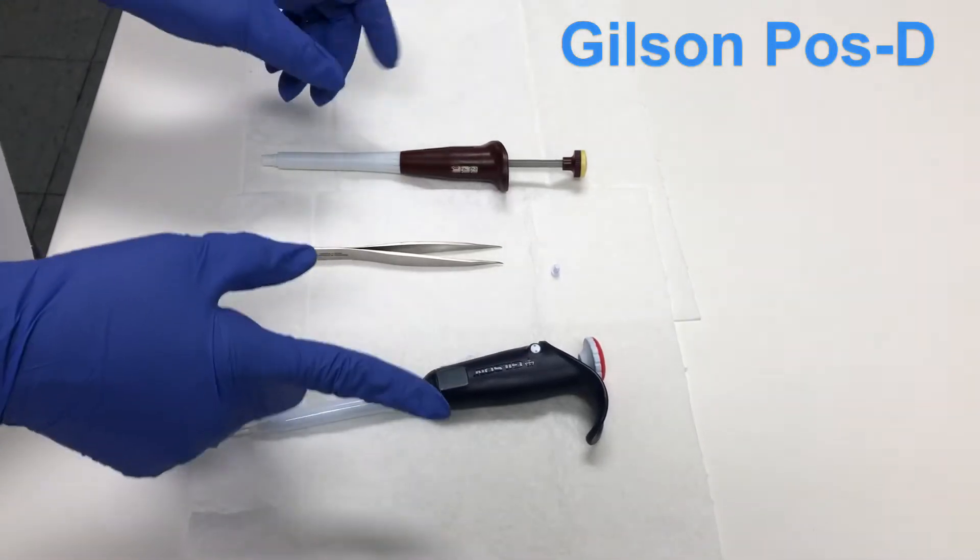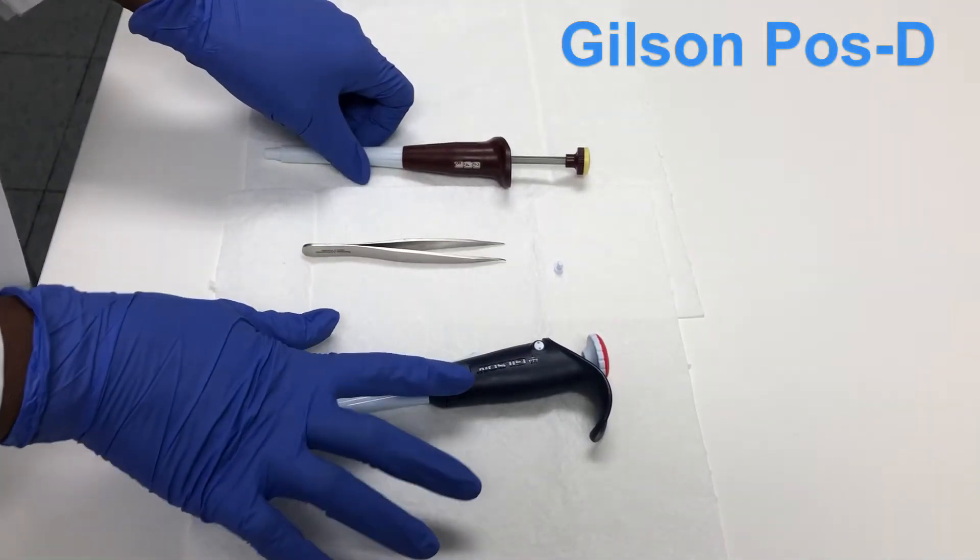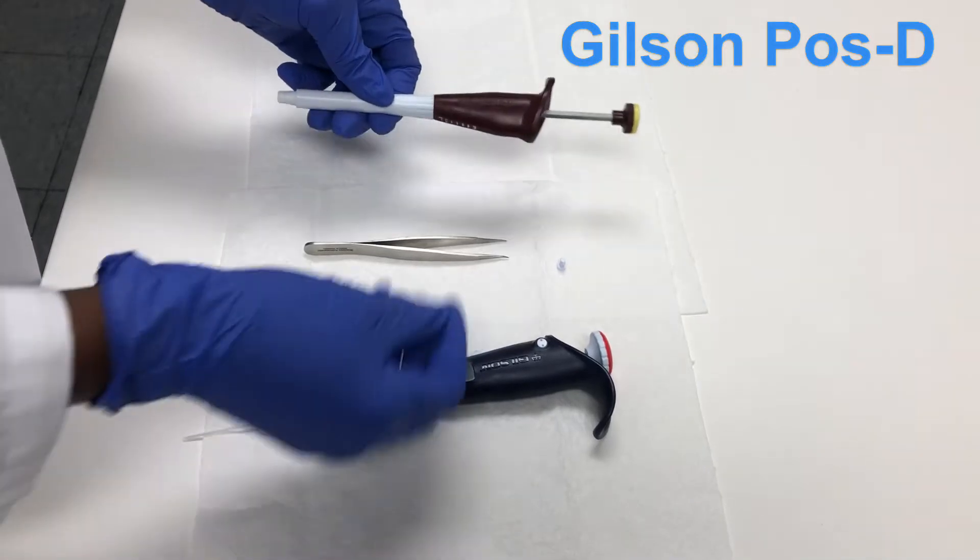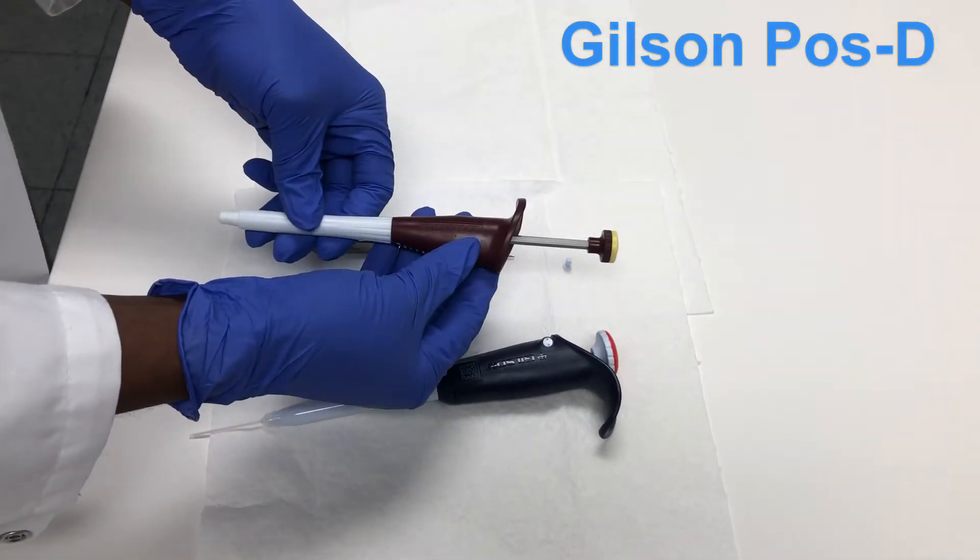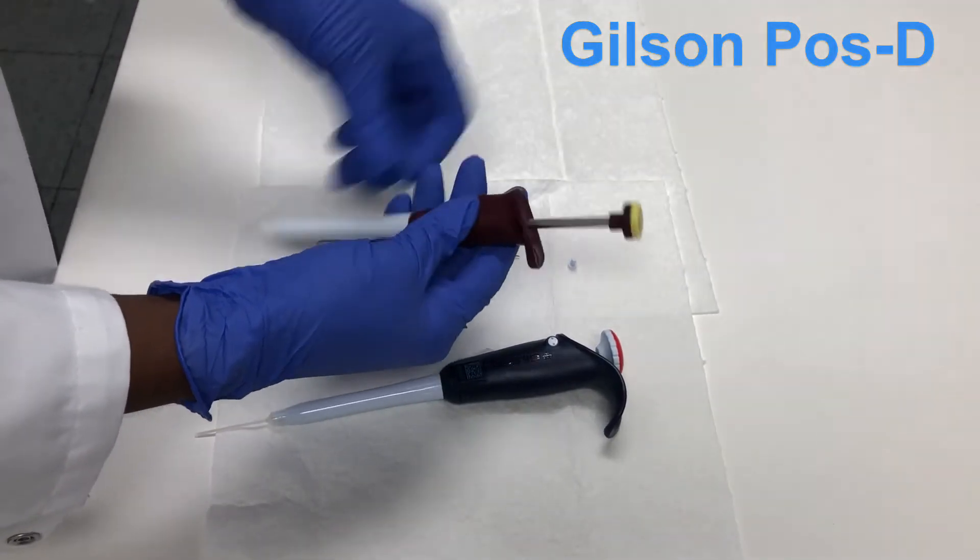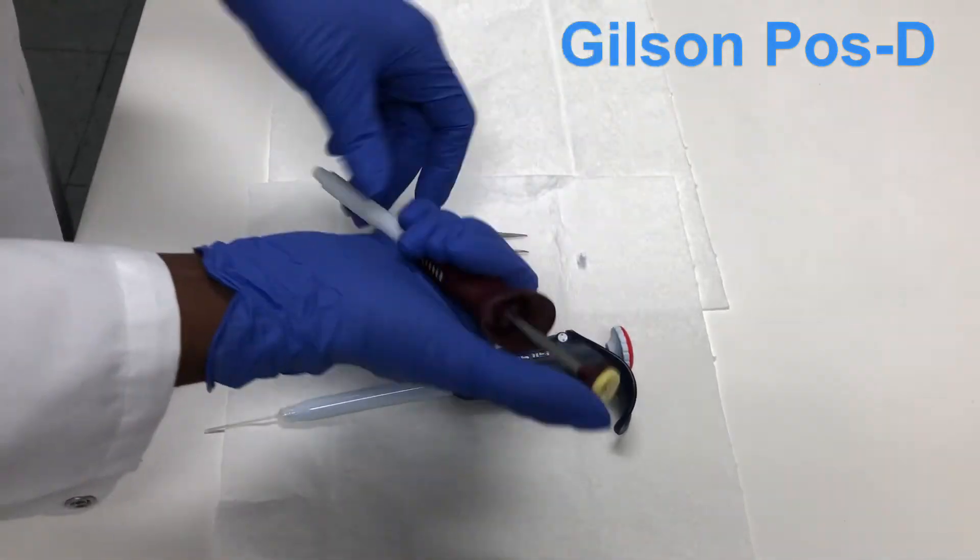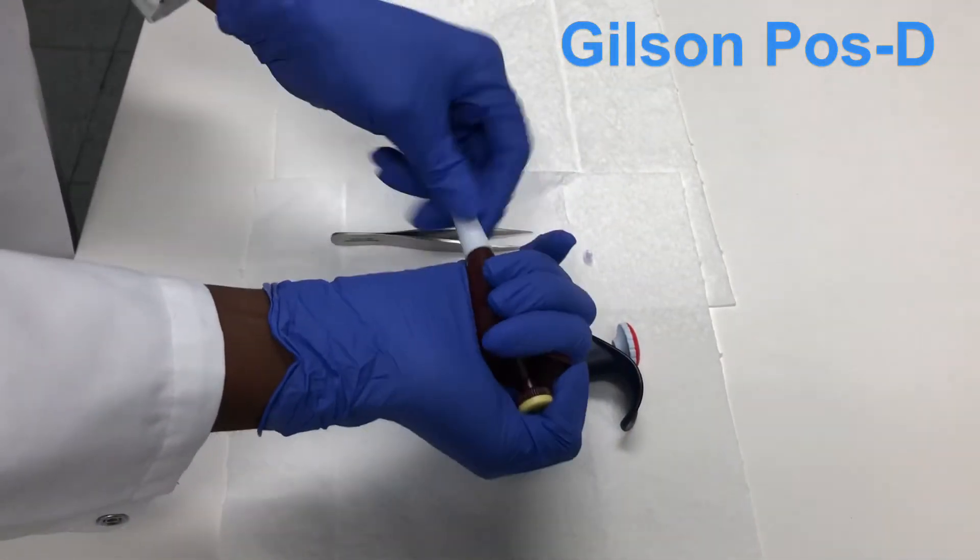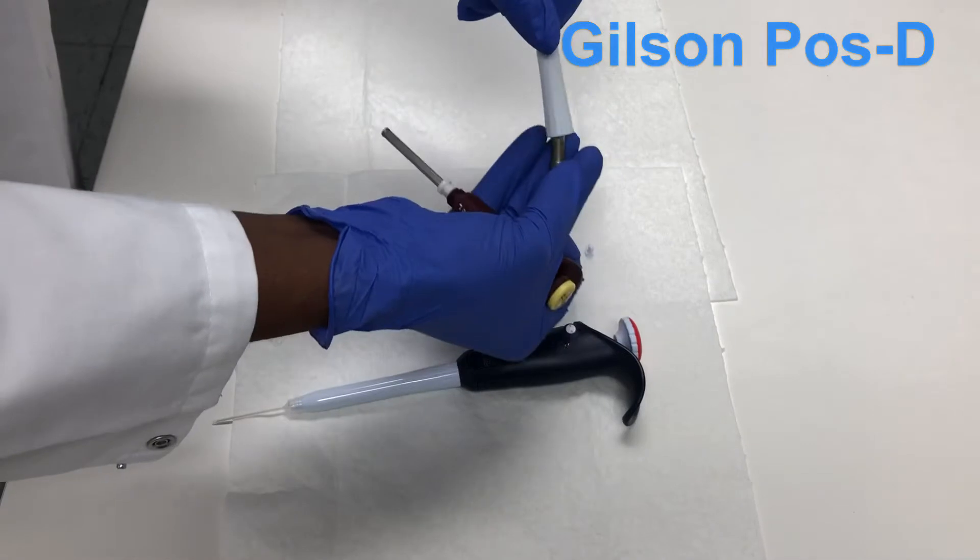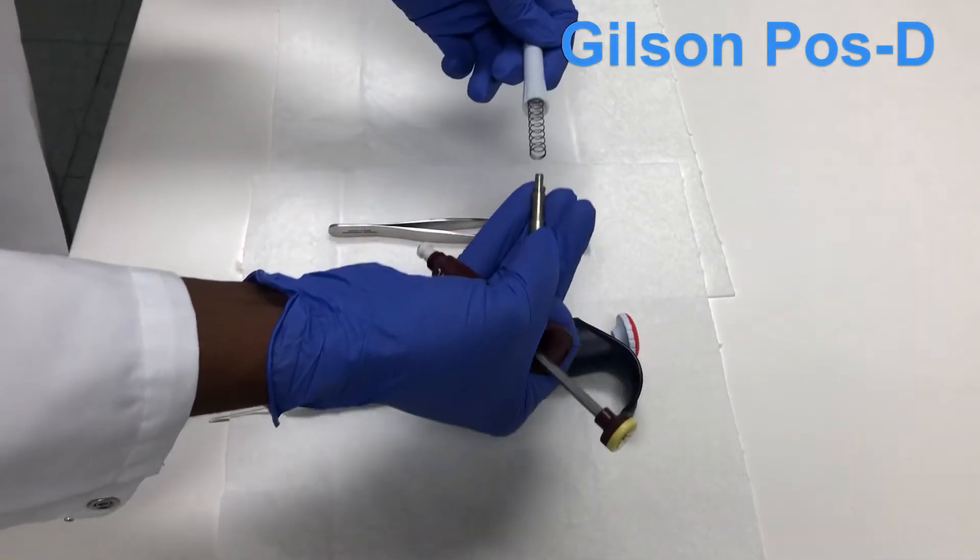Hello everyone, today we'll be learning about Gilson positive displacement pipettes. You might have seen this micro man before. If you are cleaning it, you do not need to grease it. Just take the inner parts out, clean them with your supplies as per the SOP, and then put it back.